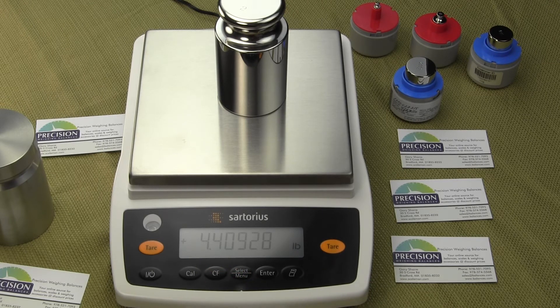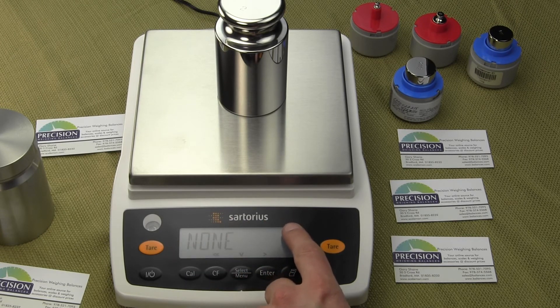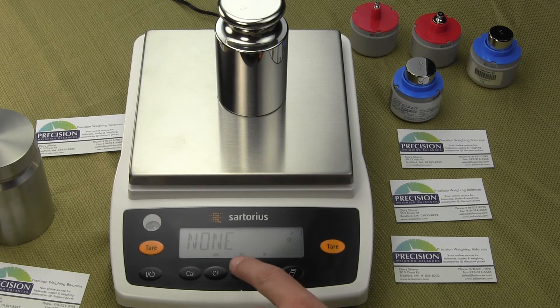Now we're back in the weigh mode and we're in pounds. To select the other weigh units, simply press the select button quickly. You'll notice it says None, and in the upper left-hand corner there's one dot — this is the first additional unit we're going to select. Press the select menu key and we'll say the second weigh mode we want is carats. To store that, simply press the enter key.